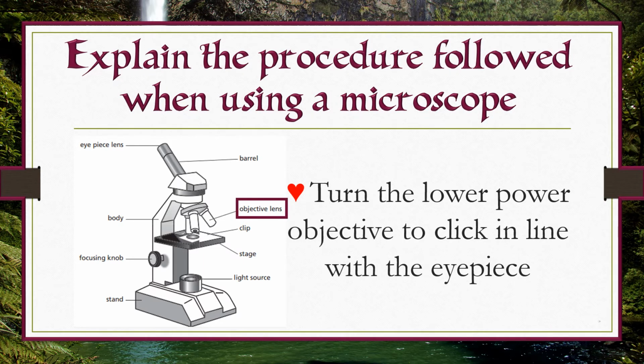Turn the lower power objective to click in line with the eyepiece.